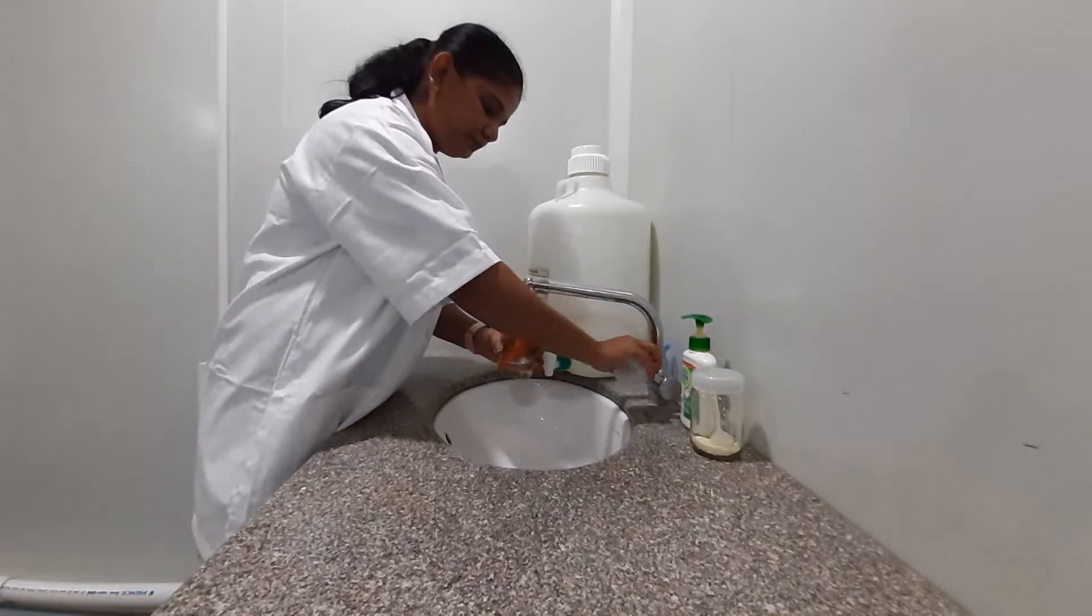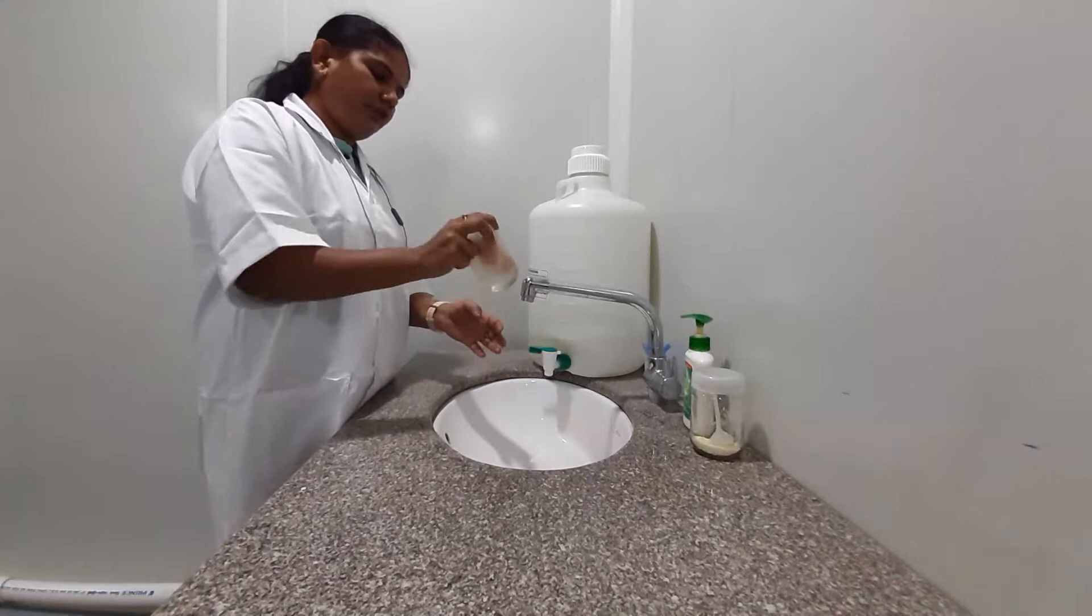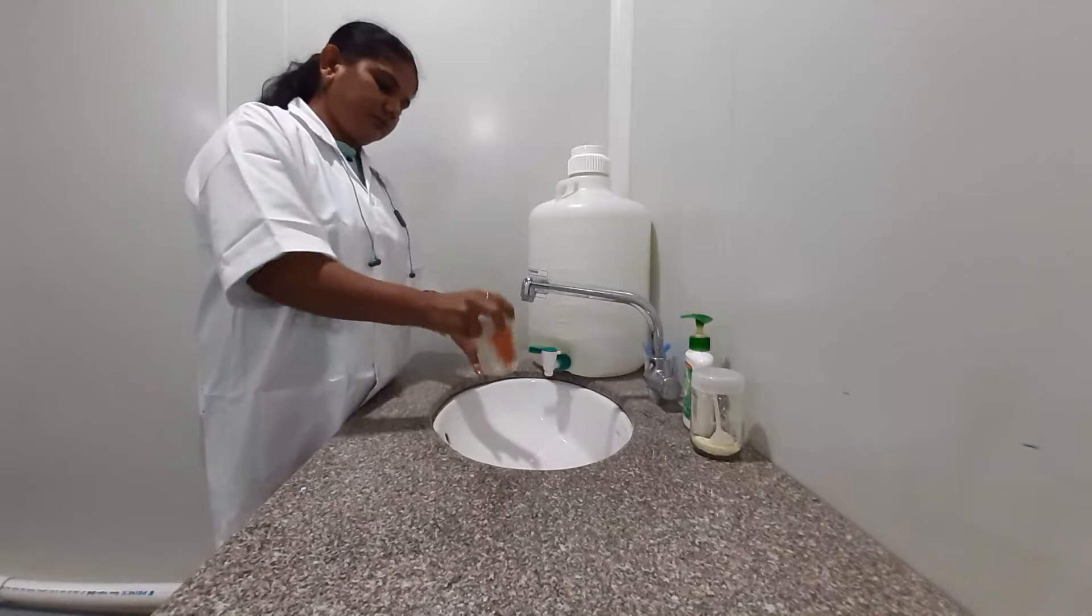First, we need to wash it under tap water to remove all dirt from its surface. Ten minutes of washing will be carried out in order to remove the dirt on the surface of carrot tissue.